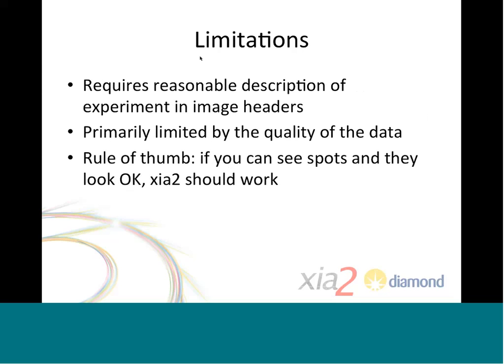Primarily, the software is limited by the quality of the data. By way of a rule of thumb, if you can see spots and they look nice and round and well separated, then XIA2 should work. If you have horrible smudgy spots and they're overlapped and so on, then pretty much no data reduction software will work. By all means, you could give XIA2 a try, but there's a good chance it won't work. So it largely depends on the quality of the input.